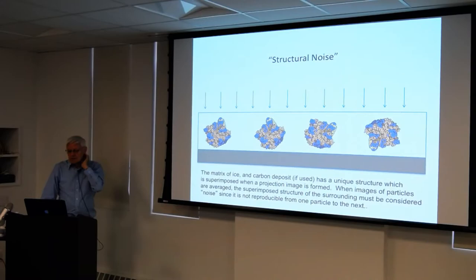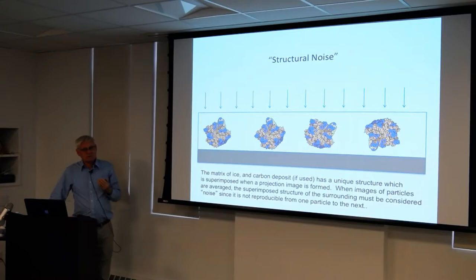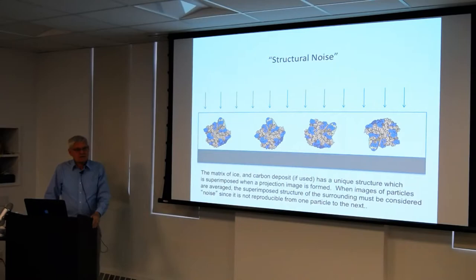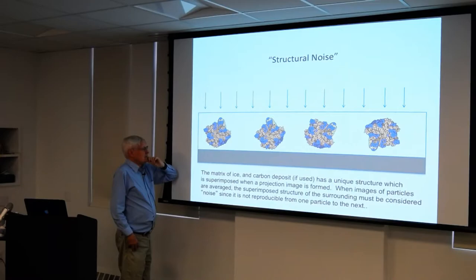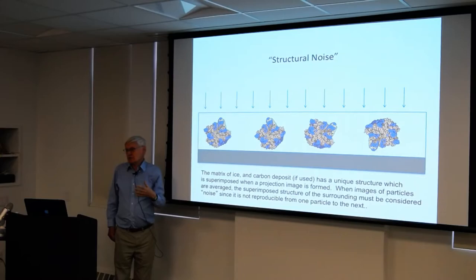So I just want to talk about structural noise. I told you what is noise and what is signal. It depends on the kind of experiment that you want to do. In this, the background structure of the carbon or of the ice is obviously a structure, and as such is a signal.